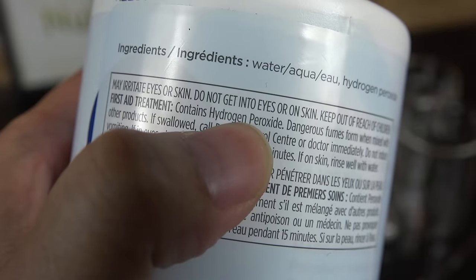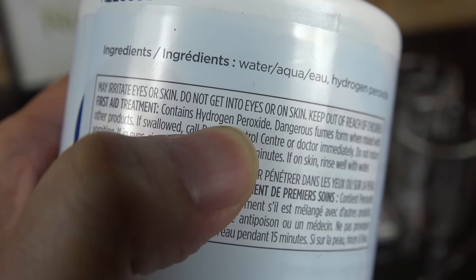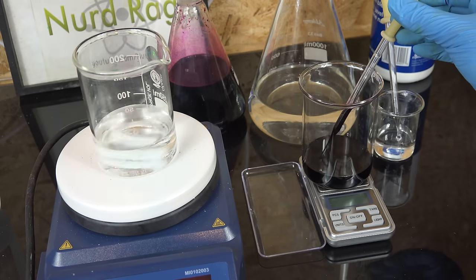Unfortunately this bottle doesn't list its concentration anywhere and without that its usefulness is considerably diminished. Even worse, this bottle is a bit old so it probably decayed in storage. Even if it listed the manufactured concentration, we don't know what it is after the decay. So we need a way to determine the current concentration.